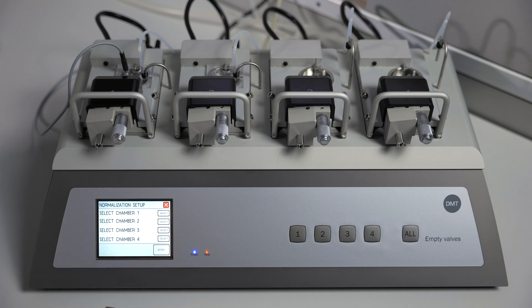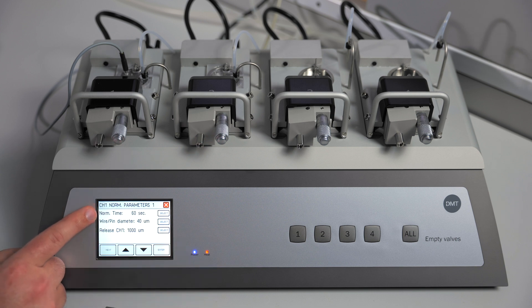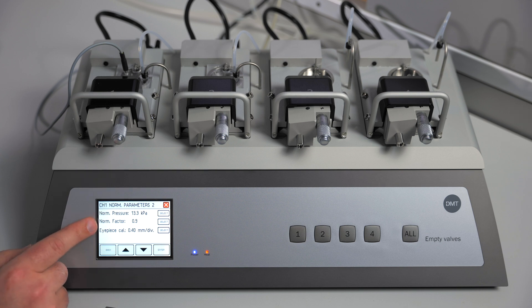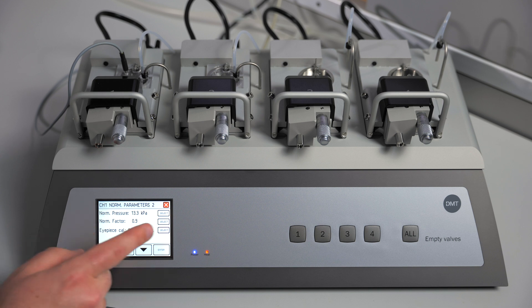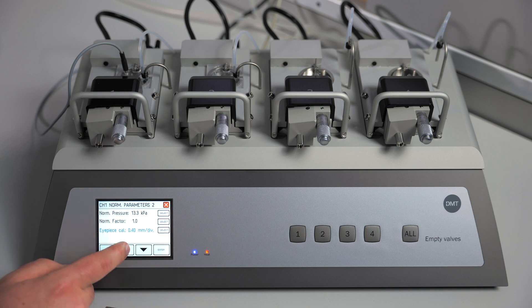Go to normalization setup and select the chamber that you will be using. We will keep a normalization time of 60 seconds — this will average the reading over 60 seconds. This is also where you set your wire or pin diameter; we will be using 40 micron wire. In the next menu, the normalization pressure for the mouse mesenteric artery is 13.3 kilopascals. We will be using a normalization factor of 1.0 and we will be changing the eyepiece calibration to 1.